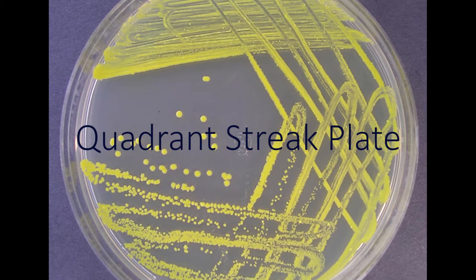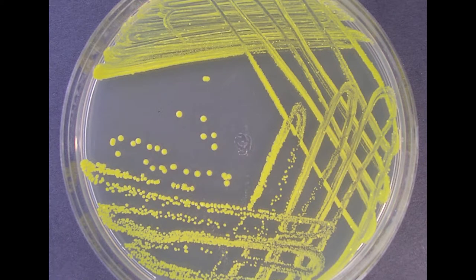The quadrant streak plate method is a method for obtaining isolated colonies of bacterial cells that may be later transferred to a new sterile medium in order to form a pure culture of that microorganism. This method decreases and dilutes the number of cells being spread to each set of streaks made on the surface of a solid medium.